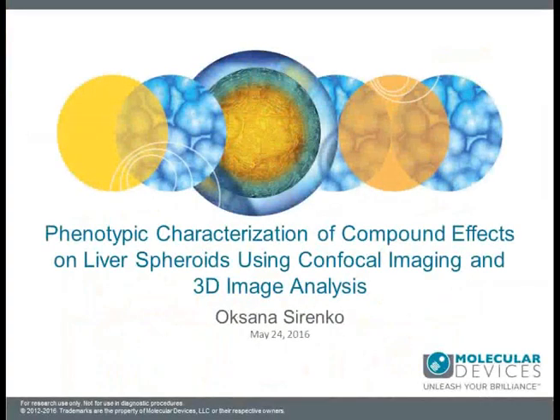Hello, thank you everyone for joining our webinar. I will be happy to present our studies about phenotypic characterization of compound effects on liver spheroids using confocal imaging and 3D image analysis. This work was done in collaboration with Cellular Dynamics International.